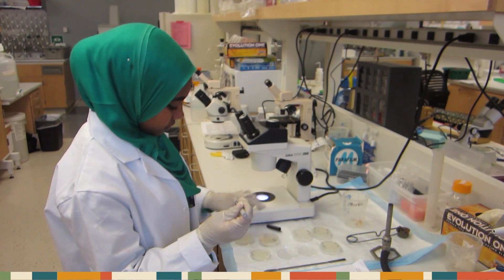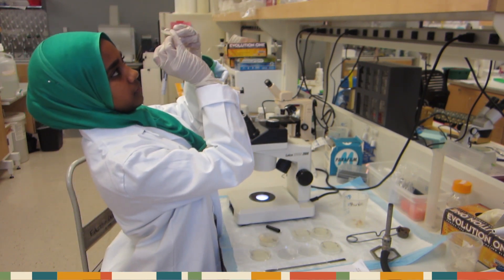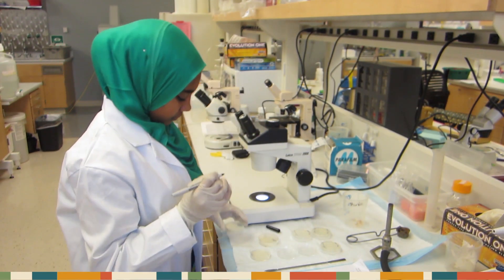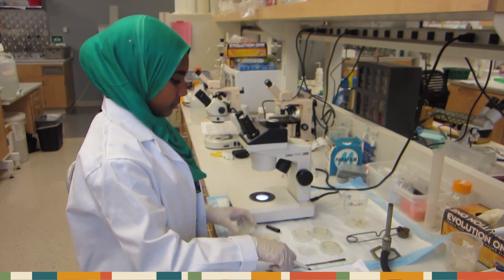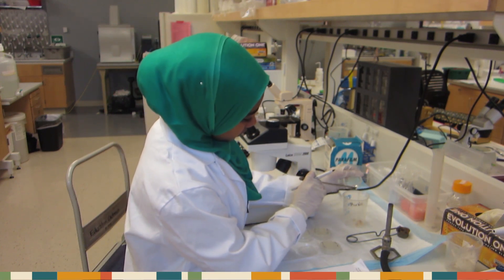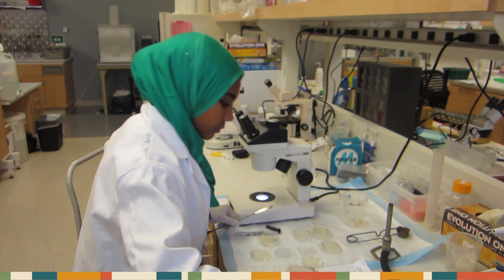Using a Sharpie, mark your drop site on the bottom of your petri dish. Then, flick off the chunk into your disposal bin. Record your time.